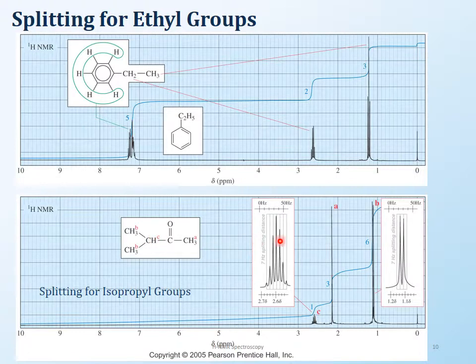All right, so let's look at the spectrum here. Here is your septet, and here is the doublet. The doublet is going to be humongous because the doublet is actually 6 hydrogens. The septet is going to be really small because the septet is only 1 hydrogen. It's looking at 6 hydrogens, but it itself is only 1 proton, the poor thing.